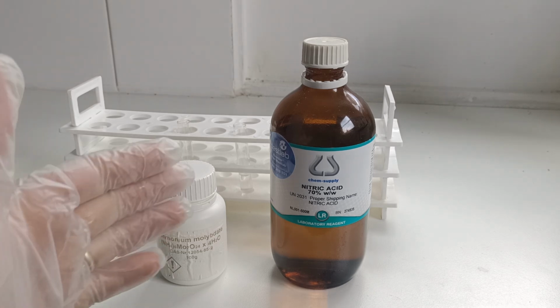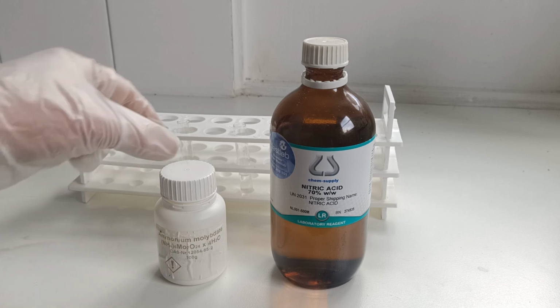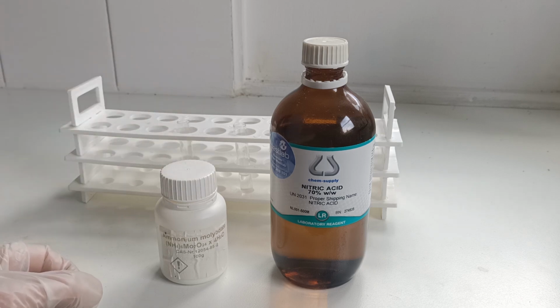So basically we're using nitric acid, 70% nitric acid, which may be very hard to get for many people watching this, but if you can get your hands on it, if you've got a legitimate reason to have it, you can get it in most states of Australia. We also have ammonium molybdate.